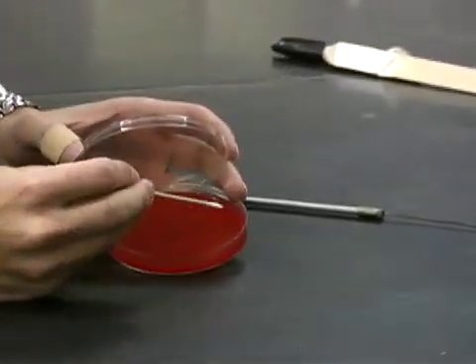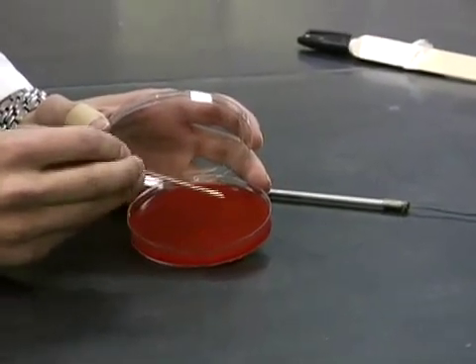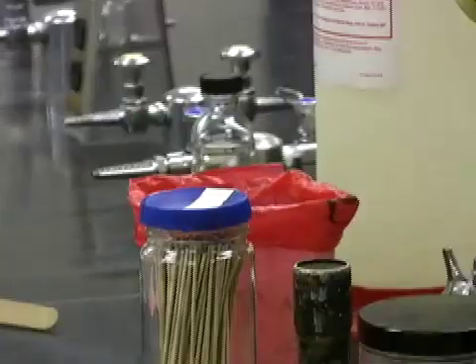Use the swab to streak the first quadrant on only half of the plate. Discard the swab in the biohazard bag.